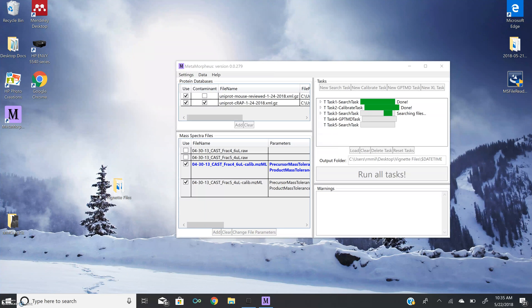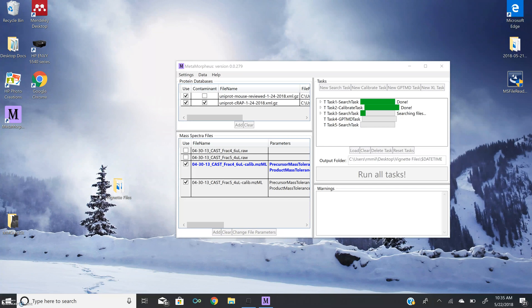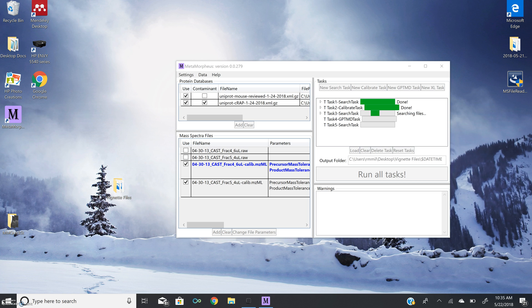Now that our calibration task has completed, I want to draw your attention to the creation of calibrated mzml files for each of the original files that were added. These now are used for all subsequent tasks.